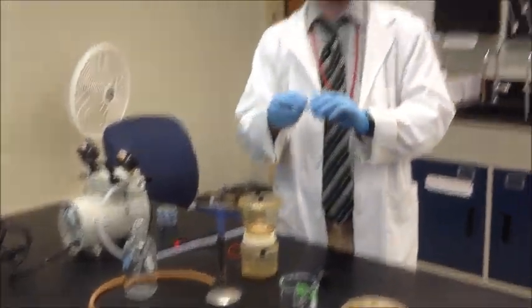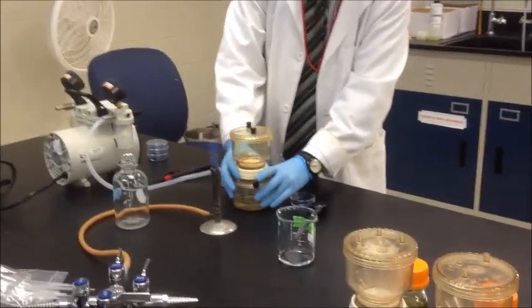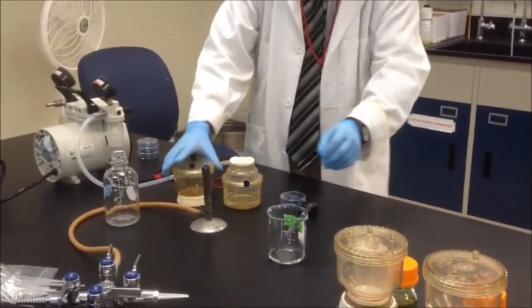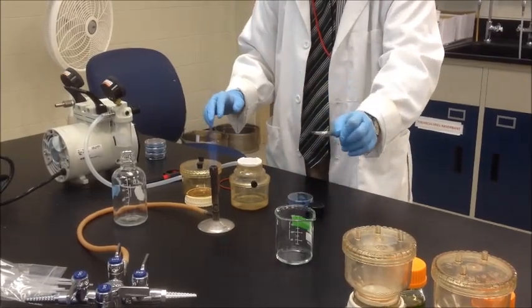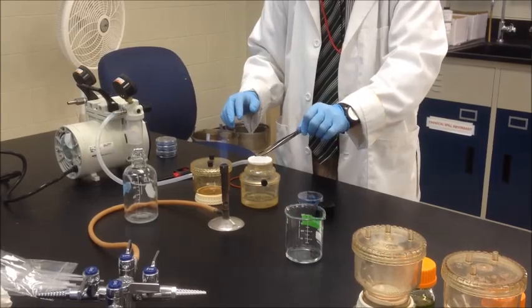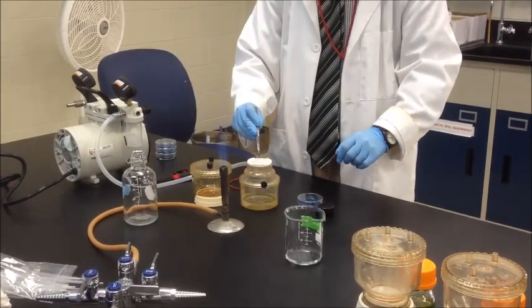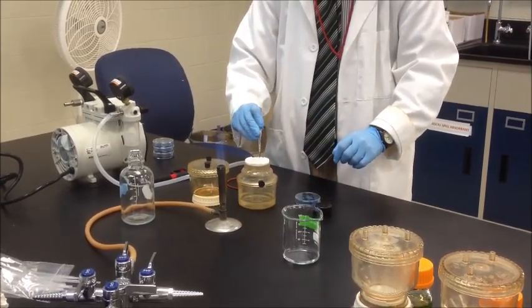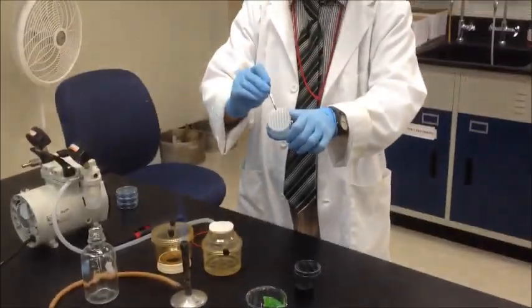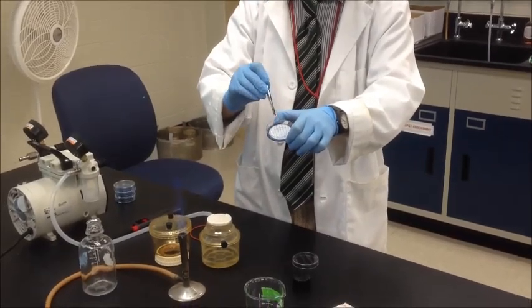Now I'm going to take my agar plate, open this up, lift, take my forceps, pass it once through the flame. Once the flame has disappeared and you've waited a few seconds, you will carefully pick up that membrane, or that filter, open up the plate, and then gently, grid side up, place that paper onto the agar.